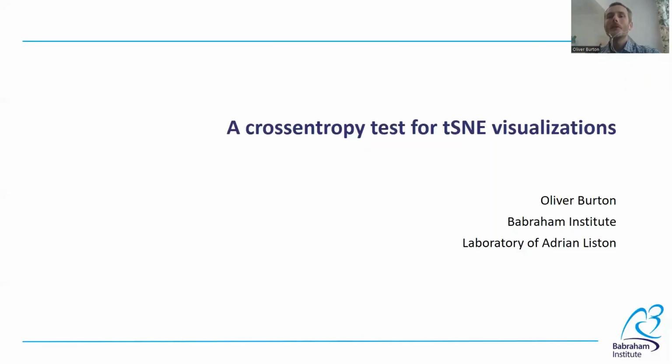Hello and welcome. It's my pleasure to share with you today a new analysis method aimed at helping you get the most out of your high-parameter data. As our data sets become more and more complex, it becomes tricky to search through them for relevant differences, and even more difficult to know when those changes are robust. The tool I'm talking about today can help with that.